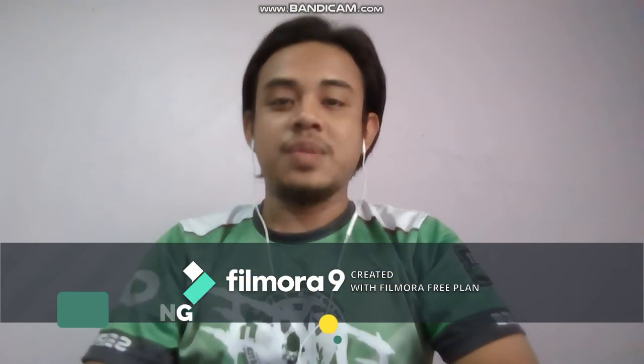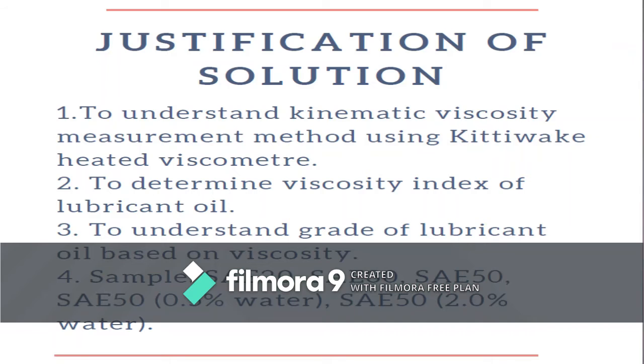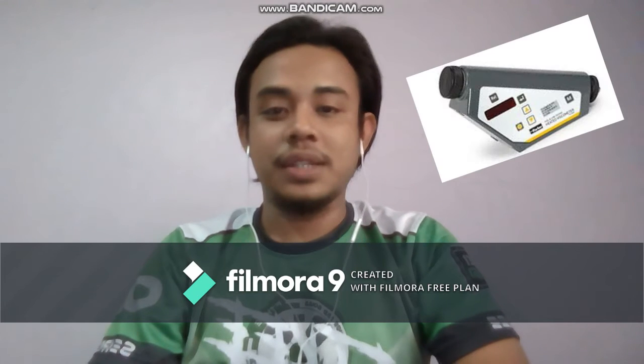Assalamualaikum. My name is Muhammad Syafiq Muhammad Khairi. I will be explaining regarding the justification of solution of our assignment. So our assignment is to demonstrate the analysis of kinematic viscosity of different grade oil. The first objective is to understand the kinematic viscosity measurement method by using a heated viscometer.